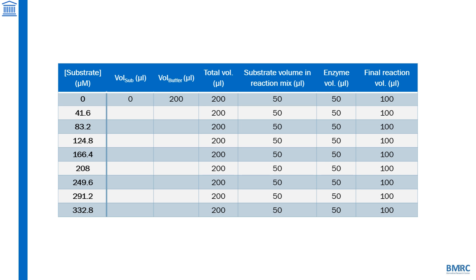Write down the concentrations of substrate used in your experiment. You can manually input the numbers but using Excel features is a better idea. The different substrate concentrations were chosen to give an even distribution of data points. They start from 80% of the TMB stock solution and decrease by 10% all the way to 0, which is pure citric acid buffer, which will act as our blank.